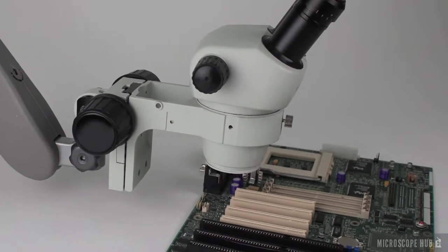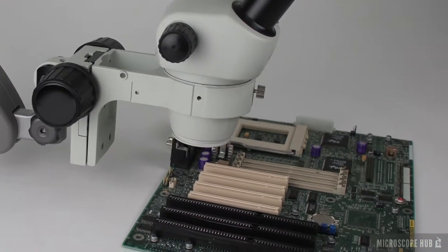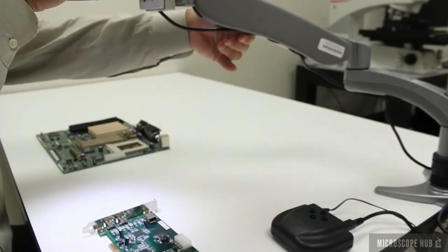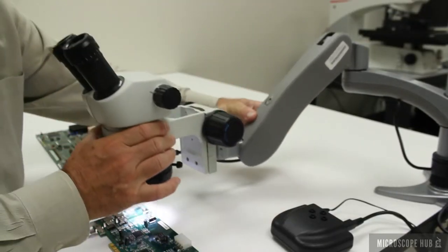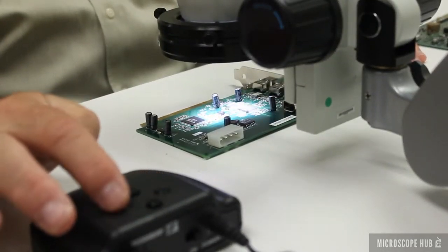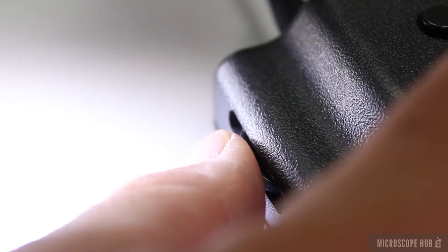The ELZ500 Stereo Microscope offers high-performance design for the cost-conscious user. The two-position flex arm provides easy movement and quick positioning. A low voltage and adjustable LED ring light provides bright illumination.